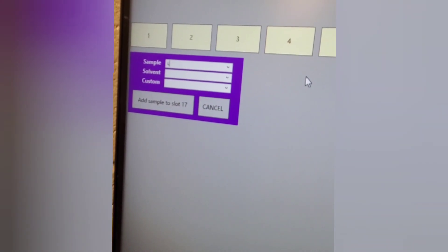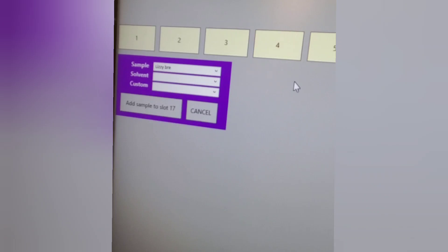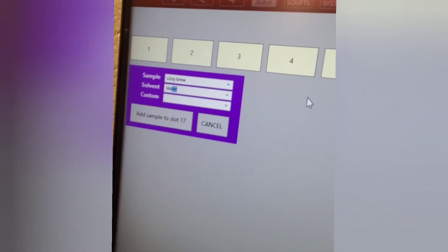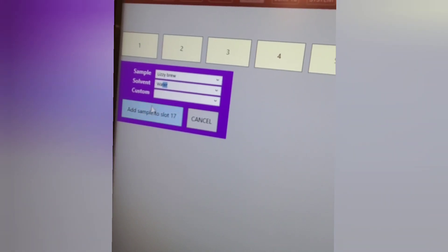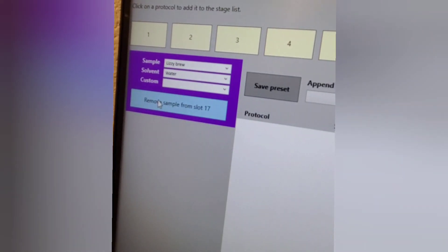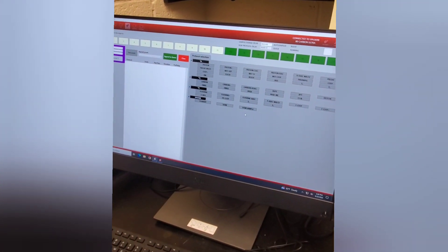I'm going to name this one 'Lizzie Brew', and we're always going to be referencing to water as the solvent. Once we have this, we can add the sample to slot 17 — hit the 'Add Sample to Slot 17' button — and now you see another menu come up.